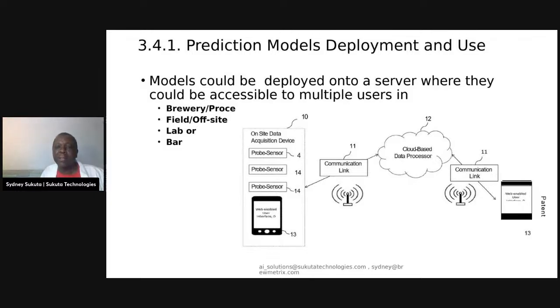Let's say you have 3 or 4 users here. Each user's machine is able to go to the cloud and extract the latest formula we have. Every time you turn on the machine, it can go to the server and make sure there are no updates. That's the kind of thing we're talking about.